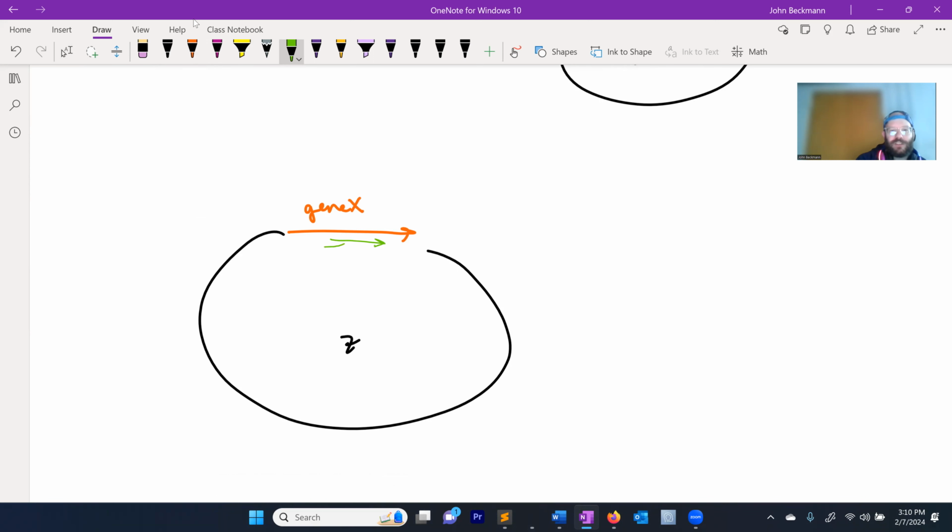Another primer will have a little bit of overlap with that other primer and go the other way. And in these PCR primers, at the spot you want to mutate, let's say it's this residue right here, you change the codon. Okay, so you make some change inside of your PCR primers such that when this thing gets amplified, the new construct will be changed at that position, okay?